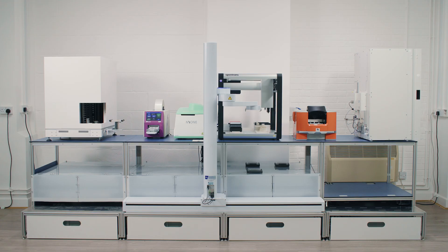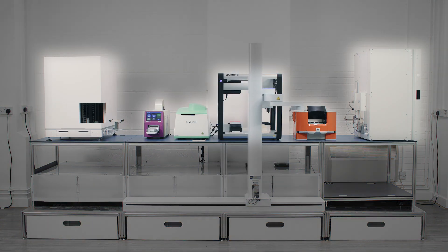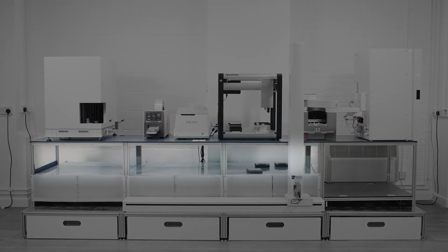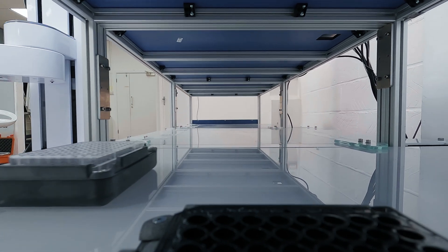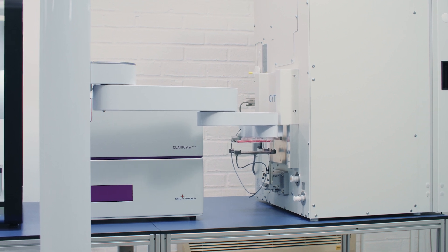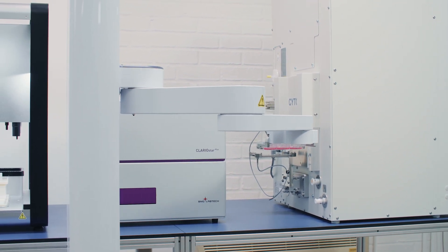The Automata lab bench is comprised of four main elements. Everything above the bench top will have third-party instruments. Underneath the bench you have the transport layer, a labware highway that can hold reagents and consumables, the collaborative robot, and its rail which will allow it to have a larger workspace.